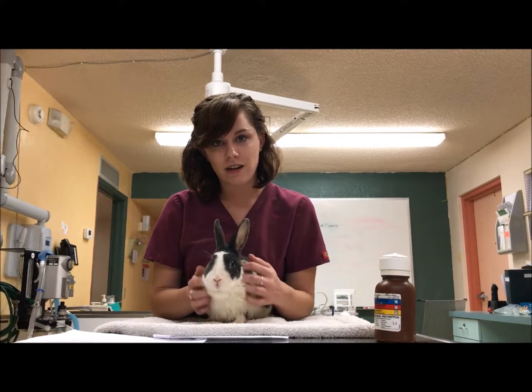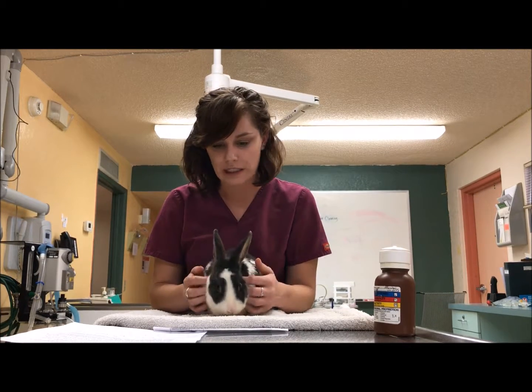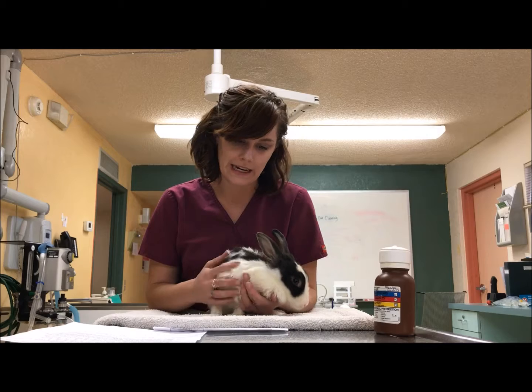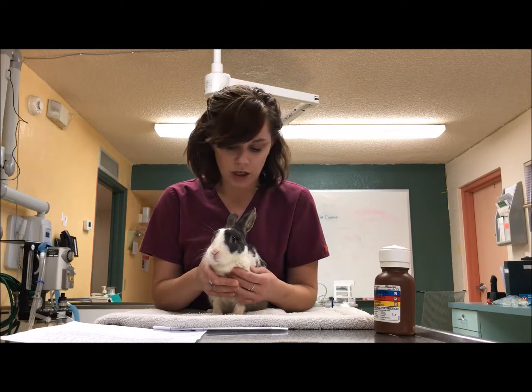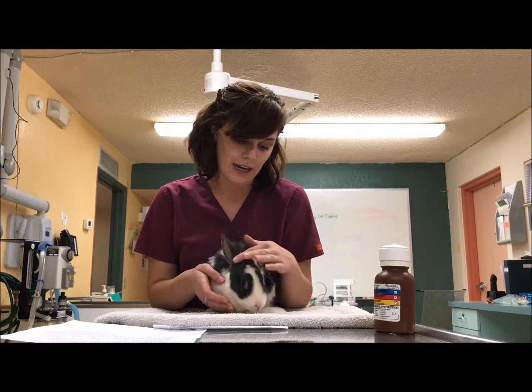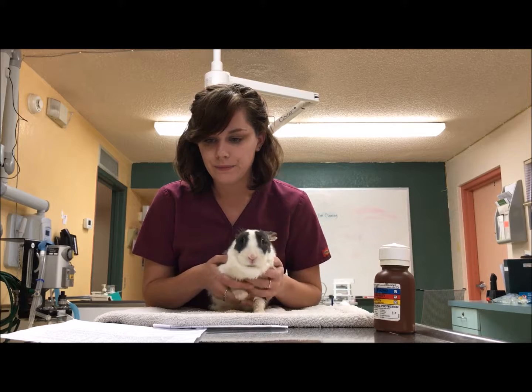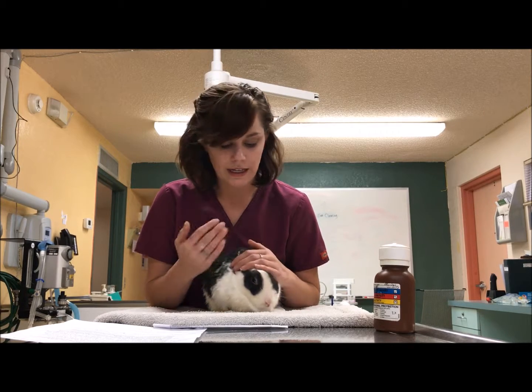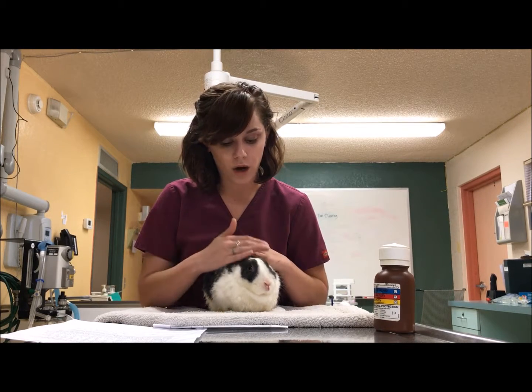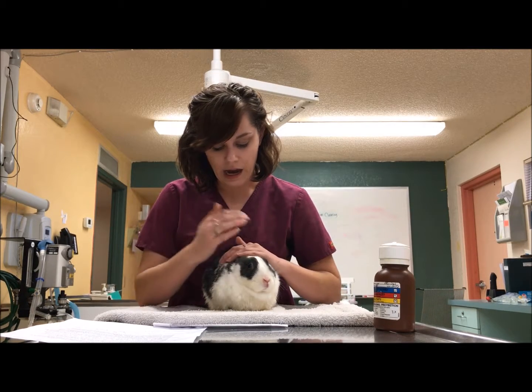All right, I'm gonna talk to you now a little bit about rabbit husbandry. This is Matilda. She's gonna be my little assistant for today. As far as their housing goes, they need to be in flat-bottomed and wire-sided cages with wire or mesh roofs. They need a hanging food hopper and water bottle so they have access to fresh water all day.